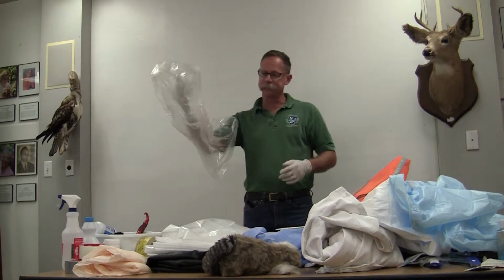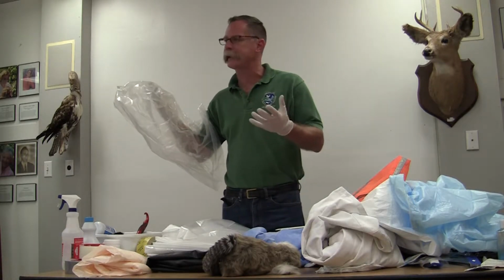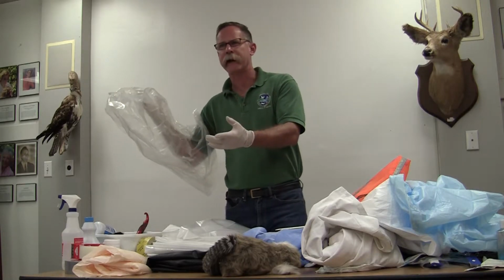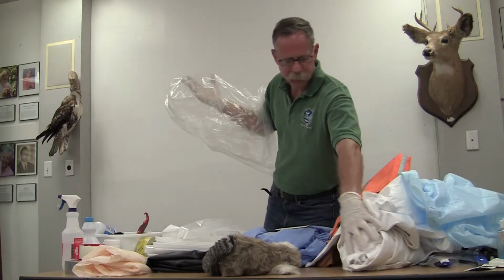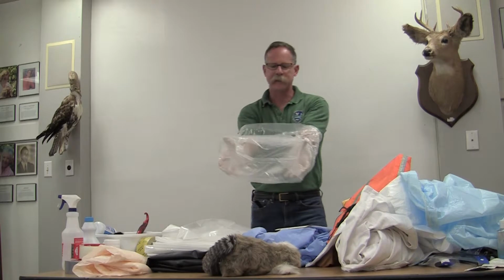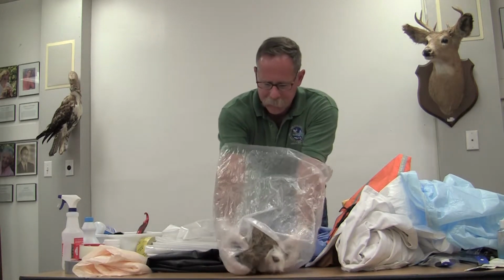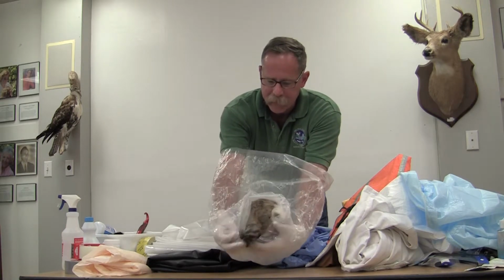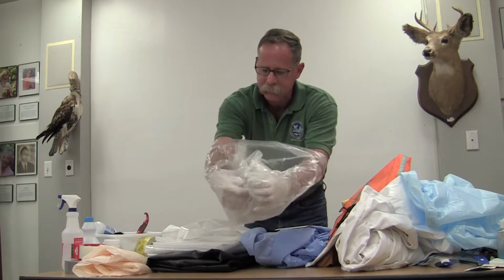So you take your bag, and the easiest way to do this is, well, you see people with dogs who pick up their dog's poop with a grocery bag or a little bag. It's the same idea. Just visualize the animal as a large dog poop. Put your arms inside the bag and pick up the animal. If the tail's loose, grab it through the bag and control it so it doesn't splatter up into your face.